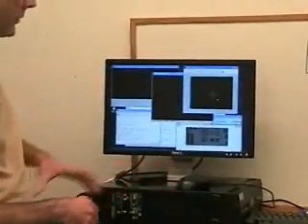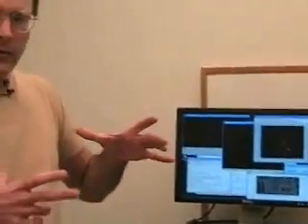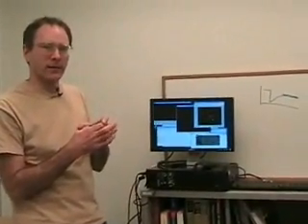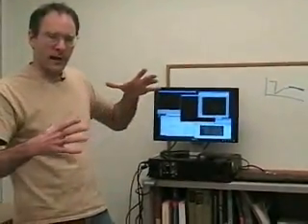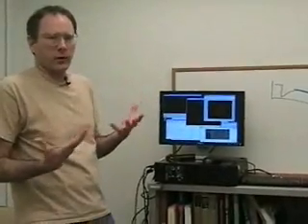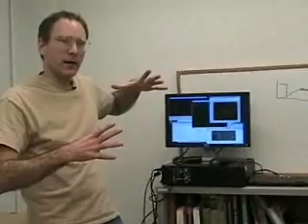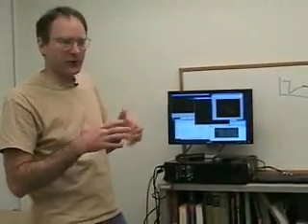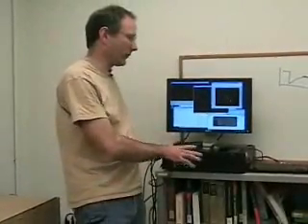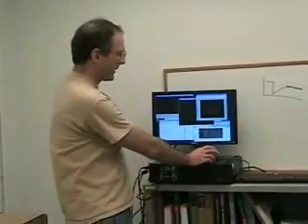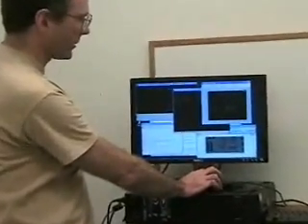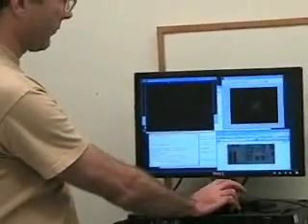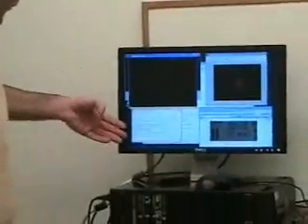And there are two things to notice. The first is I didn't draw that box much bigger than my sample. I drew it fairly tightly around the illuminated area. And the reason for that is that the more background I include, that provides me only noise, no actual data. So there's no point drawing a really big box around things. I want to draw the box fairly tight around my illuminated area. A circle would be best. It's a little bit more complicated to implement in software, so we're using a square. The second thing that's happened is that we have a new preview window here, which is just a feature of MATLAB. And I'm just going to drag this over the old one because this window is now the active one. There also are now new instructions which have come up in the command window over here.